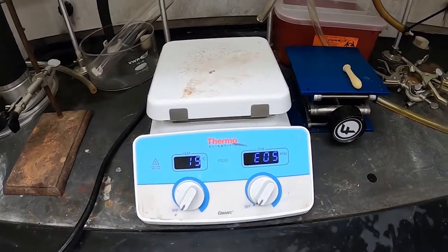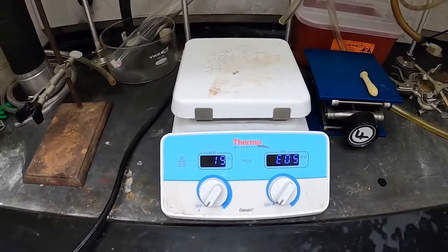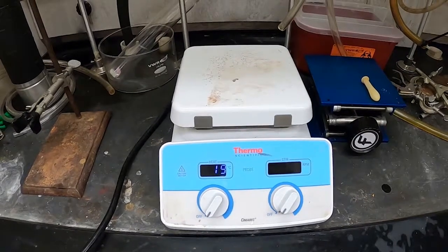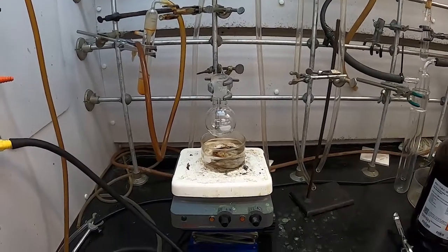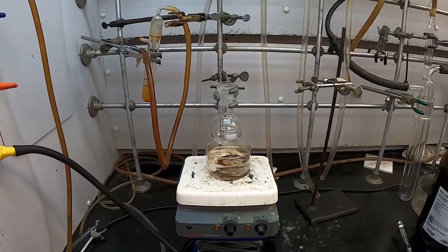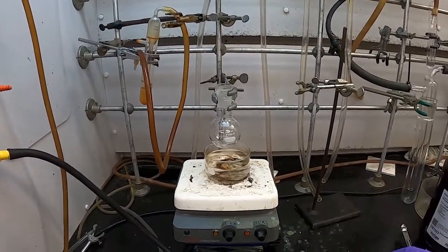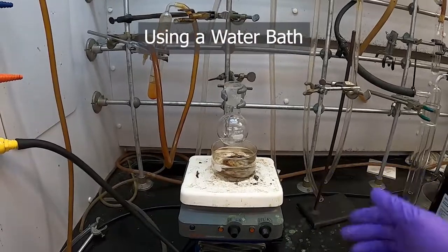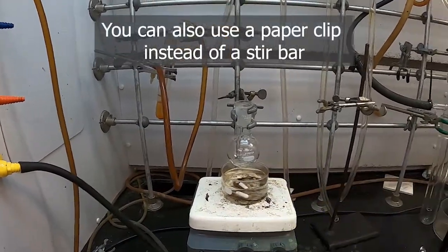There are also hot plates that don't have stirring. There are just stir plates but those aren't really used for heating so they're not as important part of this discussion. In the lab there are lots of different times where we'll need to heat the reaction that we're performing, and the method that we use to heat that reaction is determined by our setup, the size of it, and other things as well as how hot we need to get it to. One of the simplest ways that we can heat an apparatus is a water bath. So we have here our hot plate, and one of the things we need to do is add a stir bar to our water bath here.